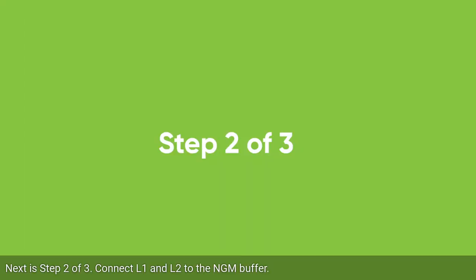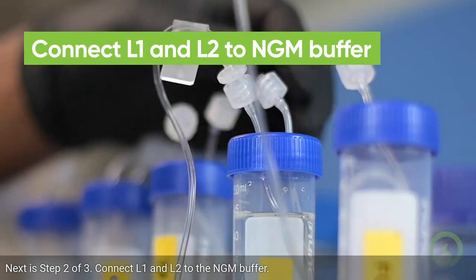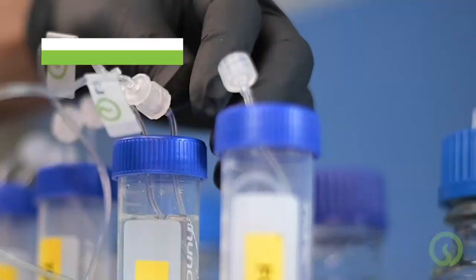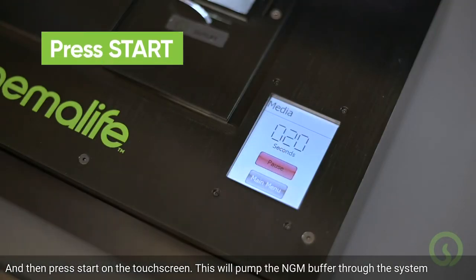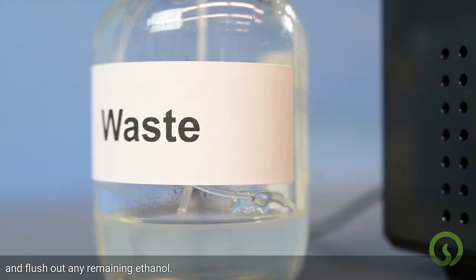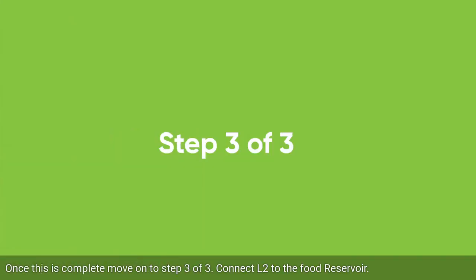Next is step 2 of 3. Connect L1 and L2 to the NGM buffer and then press START on the touchscreen. This will pump the NGM buffer through the system and flush out any remaining ethanol. Once this is complete, move on to step 3 of 3.